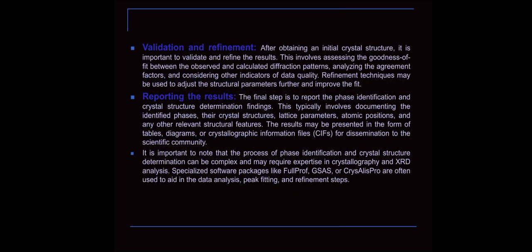Validation and refinement. After obtaining an initial crystal structure, it is important to validate and refine the results. This involves assessing the goodness of fit between the observed and calculated diffraction patterns, analyzing the agreement factors, and considering other indicators of data quality. Refinement techniques may be used to adjust the structural parameters further and improve the fit.